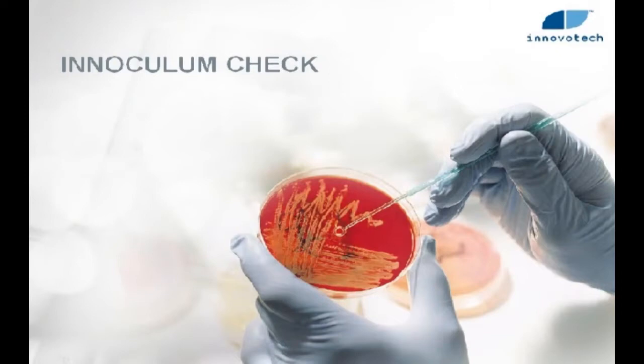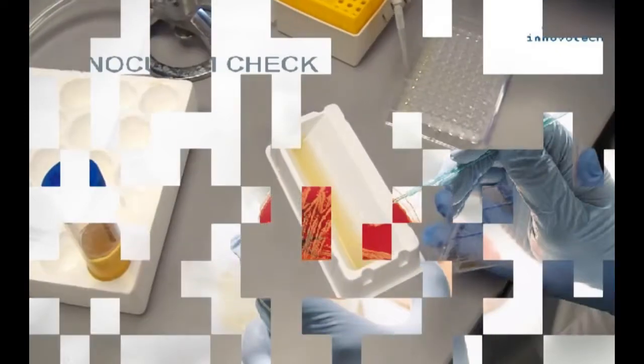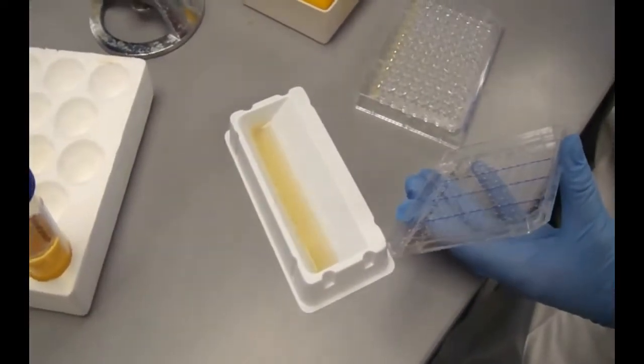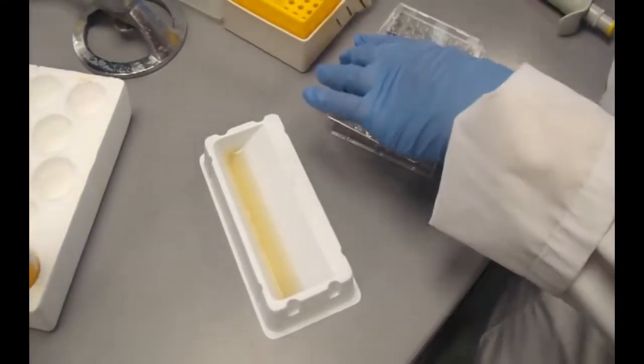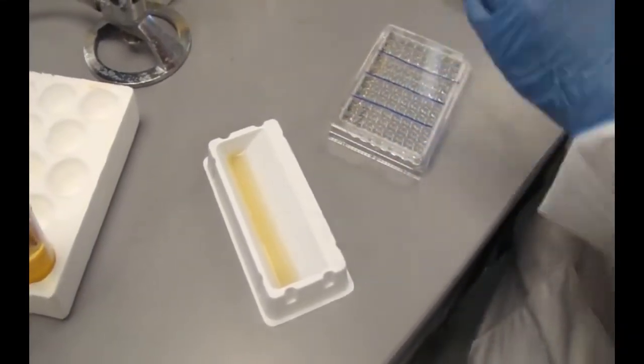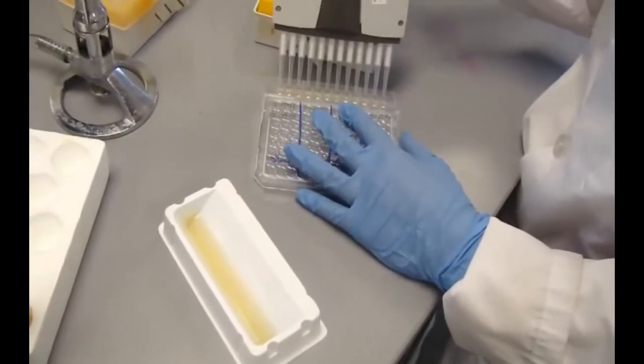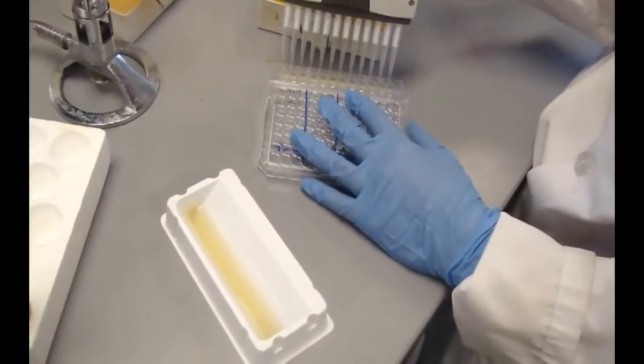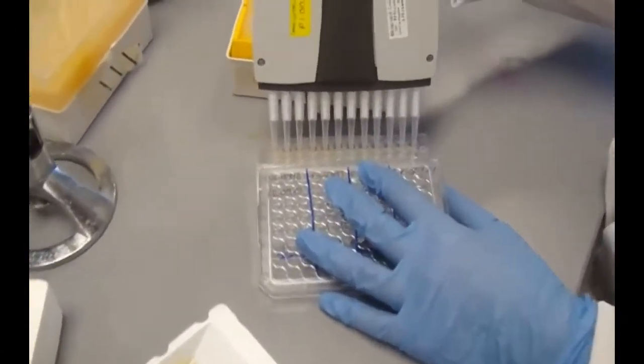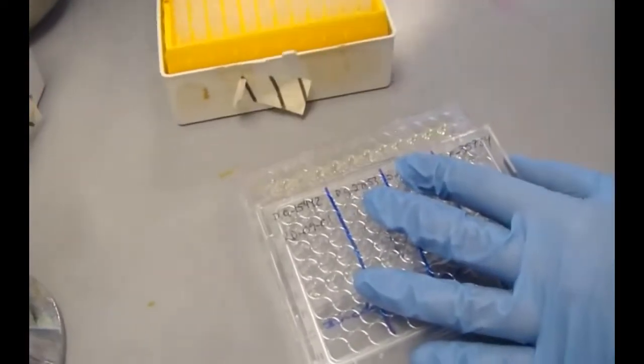The cell density is confirmed by serially diluting and spot plating the inoculum. A serial dilution 10^0 to 10^-7 is prepared by transferring 20 microliters down each of the 8 rows.